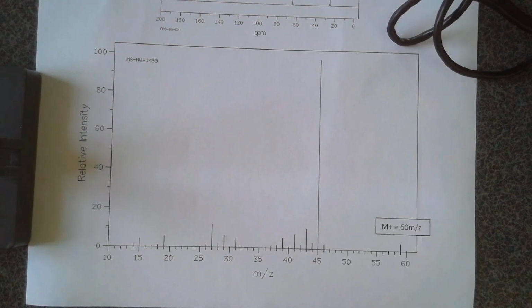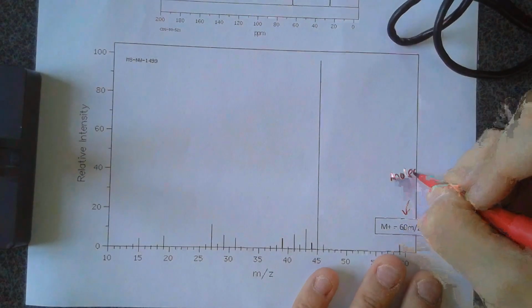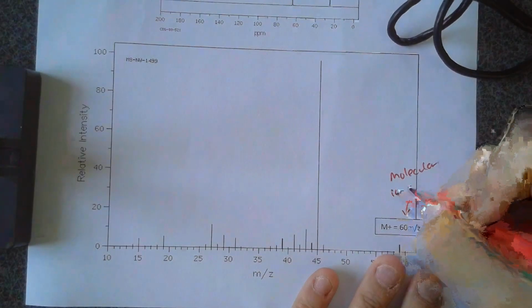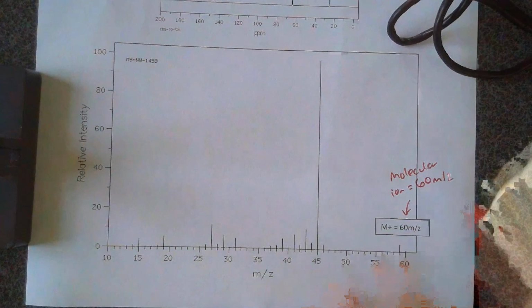And so that is an example of me giving it to you. You should still identify it as the molecular ion, though, just to show that you know what it means. So you'd say molecular ion is equal to 60 mass to charge ratio.